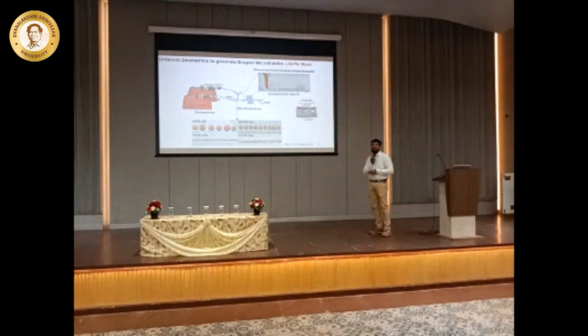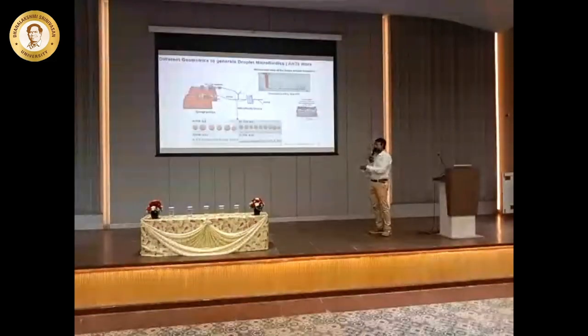You can see that the size of the particles changes. The droplet sizes are different. Here, if you see the flow rate ratio, which is 0.2, the droplet size is almost the channel size. See how the channel is very clear. Previously you found there were some surface structures present, but now we could see a very smooth structure here. This is all optimized over years.